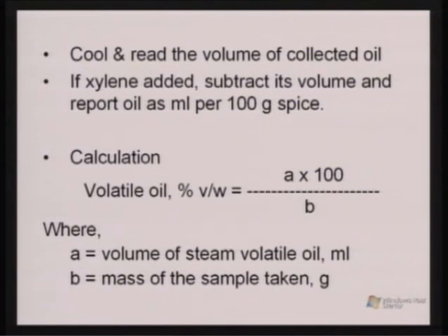Here you need to take a precaution. You should not read the oil content while it is hot. You should cool the content first. Then you will get the exact volume of the oil. If xylene was added, subtract its volume and report oil as milliliter per 100 gram spice.